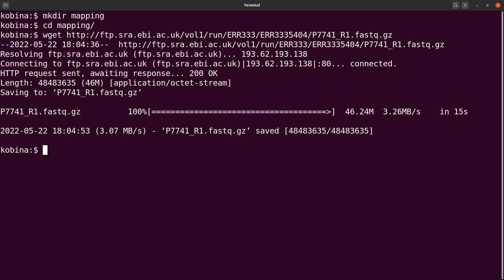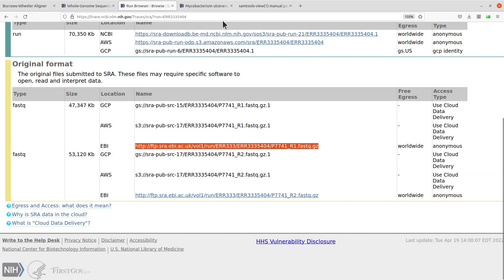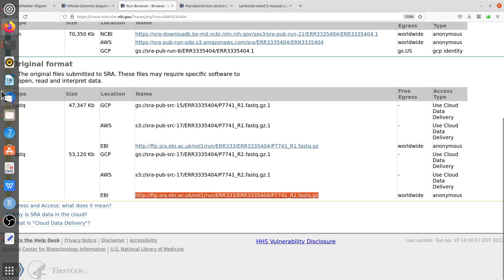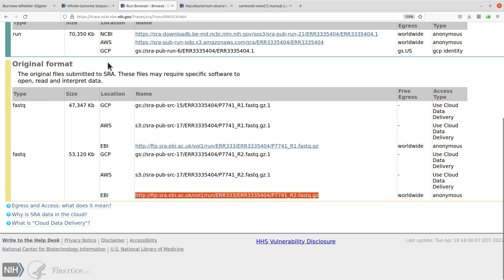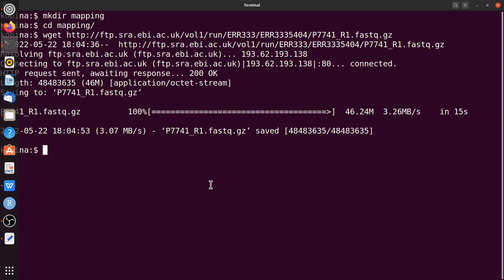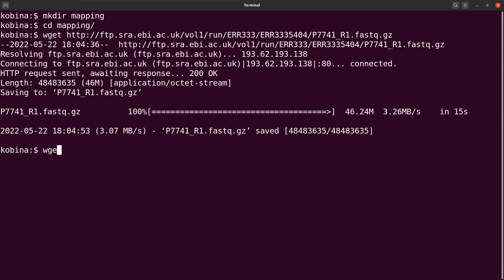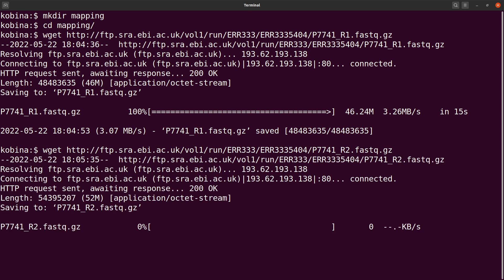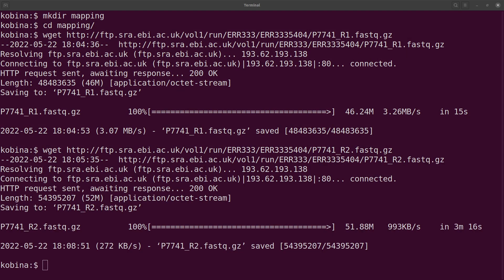Now let's get read two. I'll copy the link for read two, go back to the terminal, run wget with the link, and download it. Read two has also been downloaded.